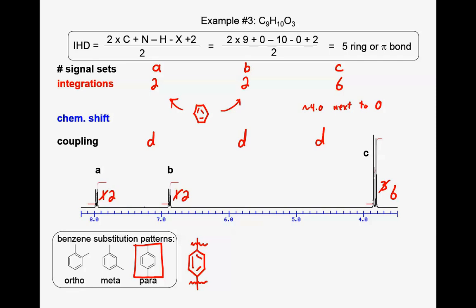No, so what we're going to have to do is have most likely equivalent sets of methyls, right? If we had one CH3 and another CH3 that were the same, that would add up to 6. So let's think about what this could look like. The only thing I could come up with would be, let's say we have CH3, CH3. And so if they're split into doublets, we're going to have 1 proton off the neighboring carbon, and then there's some other stuff going on.